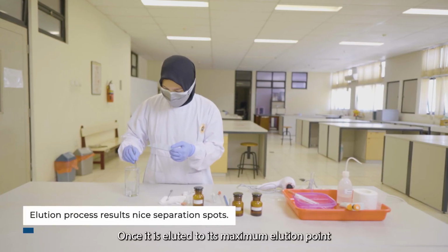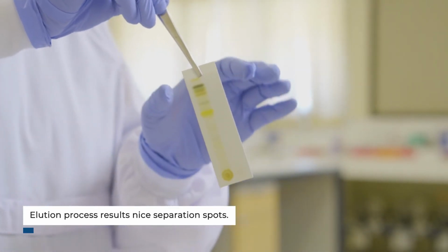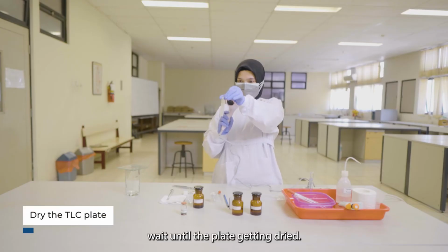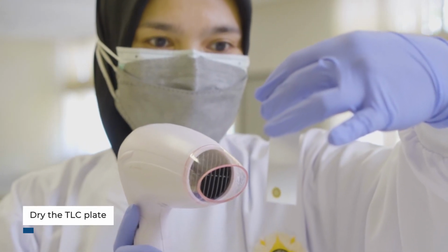Once it has eluted to its maximum elution point, in other words 8 cm from the spotting area, take the TLC out of the chamber. Wait until the plate is dried, or you may use a hairdryer to speed up this step.